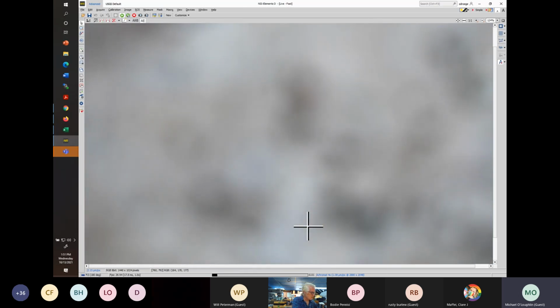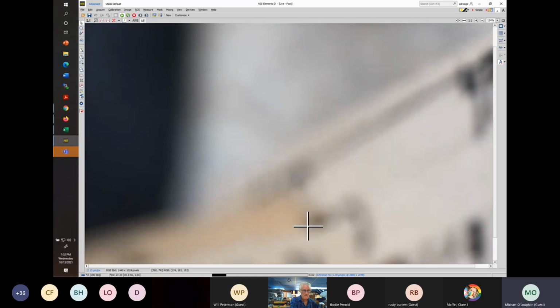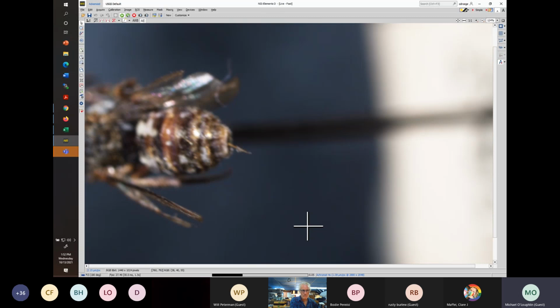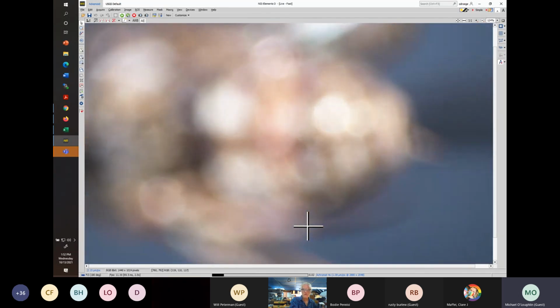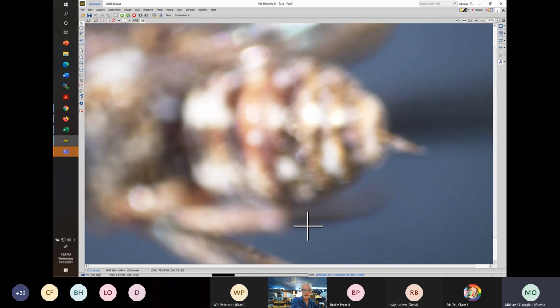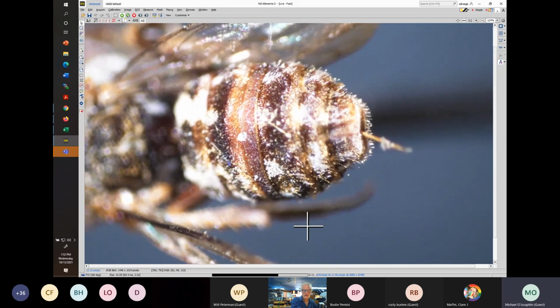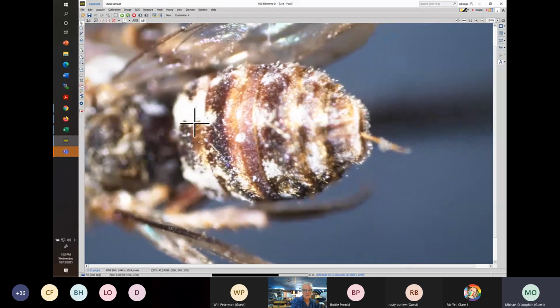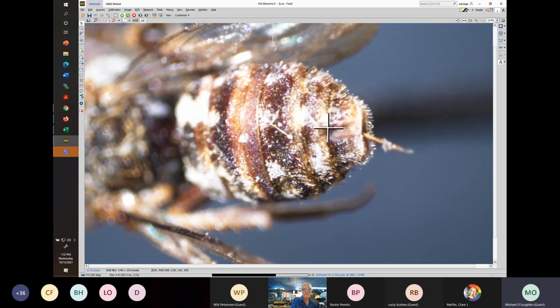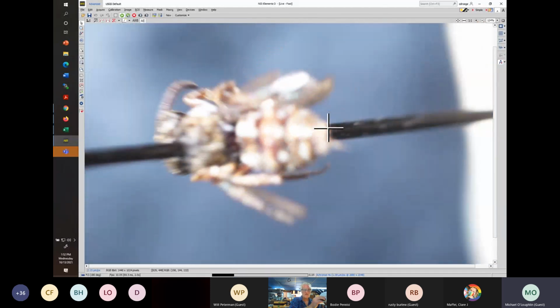And if we grab a female here, I believe this is a female, we have the same number of antennal segments as the male, which is 12, but we have a sting in this case poking out, but again, the sting can always be retracted. We have no pygidial plate back there, and we have the more usual 5 segments.